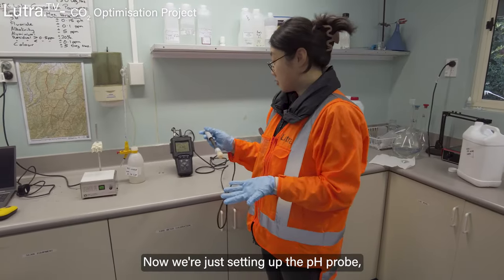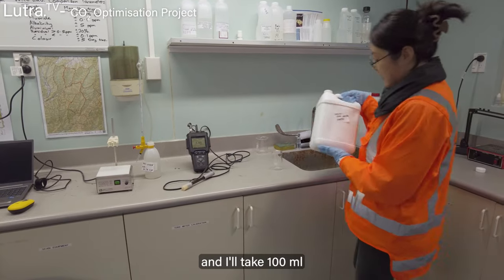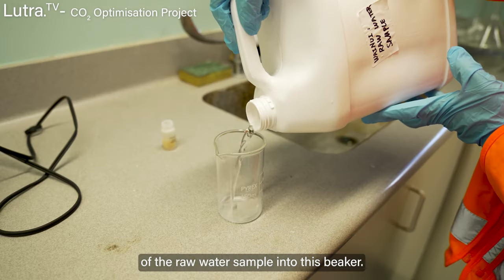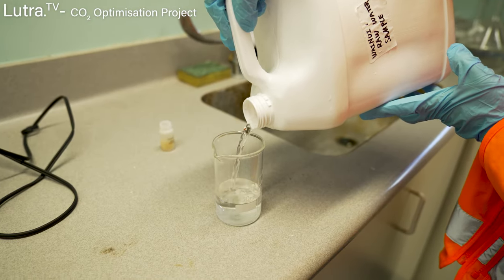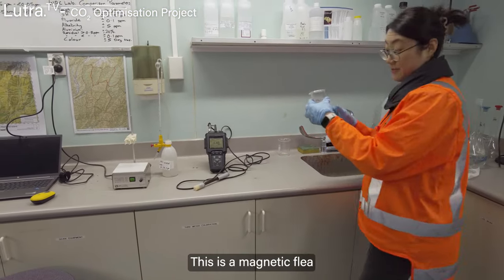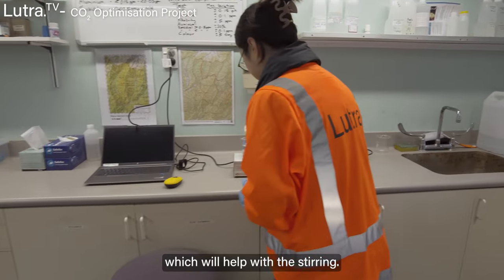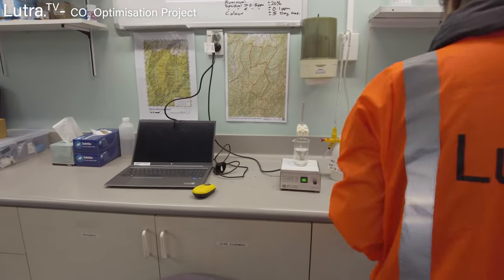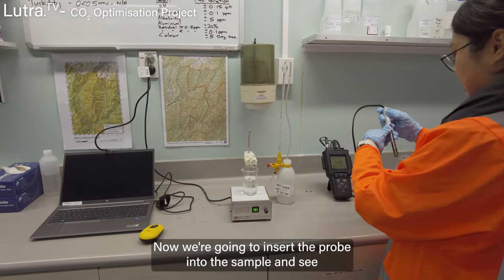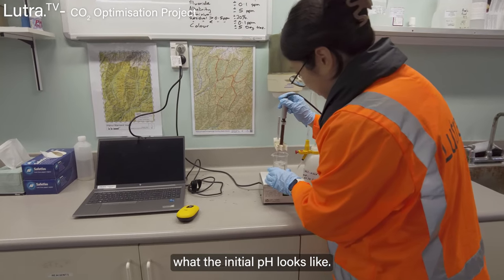Now we're just setting up the pH probe. I'll take 100 ml of the raw water sample into the beaker. This is a magnetic stirrer which will help with the stirring. Now we're going to insert the pH probe into the sample and see what the initial pH looks like.